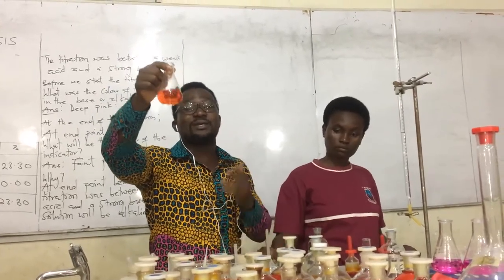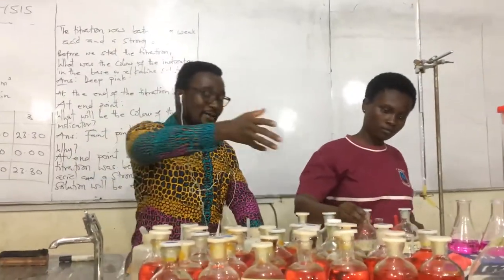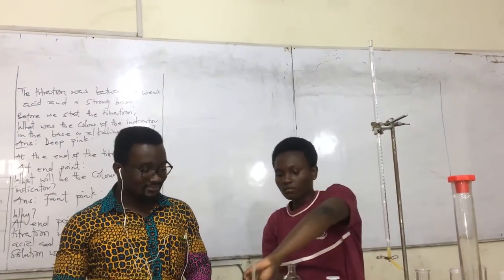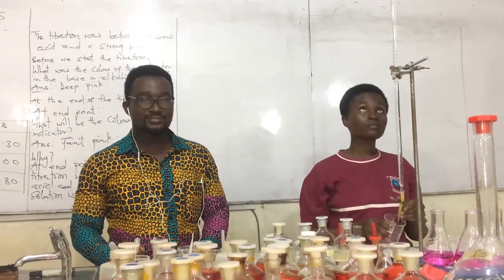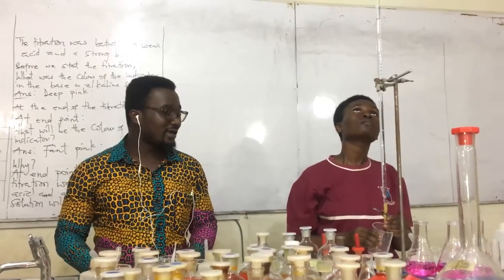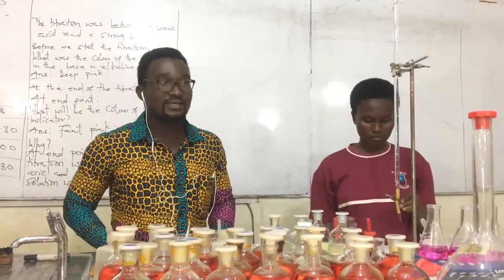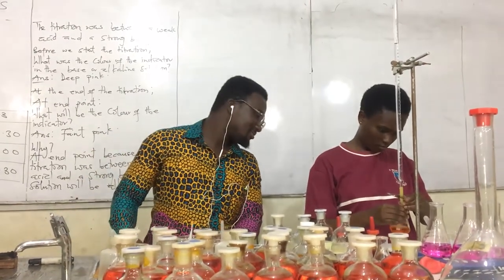It did not occur just like something which just appeared. No. This is not magic, it's science. So we are going to look at how the values affect our various analyses and the rest. Okay. So she's brushing out the air bubbles to get uniformity in the burette. She has done that nicely. Okay, so she has begun with the last titration.